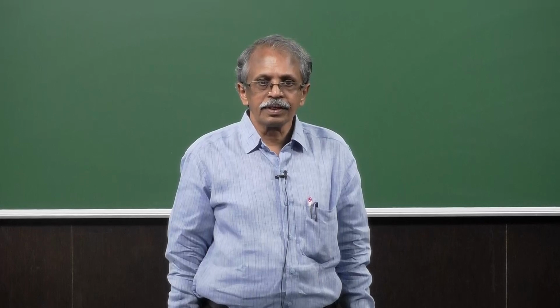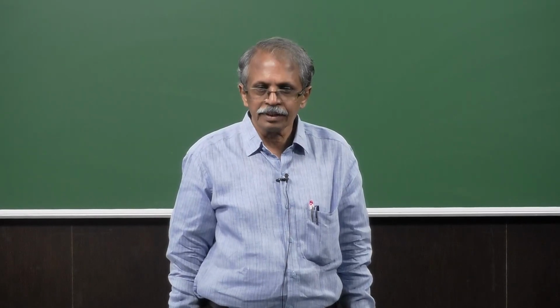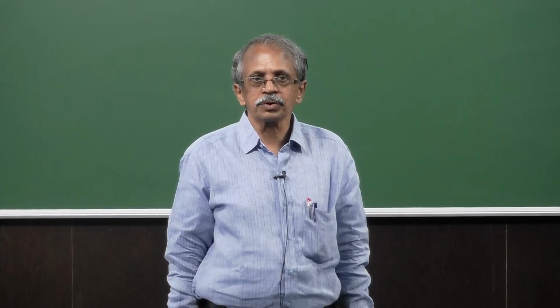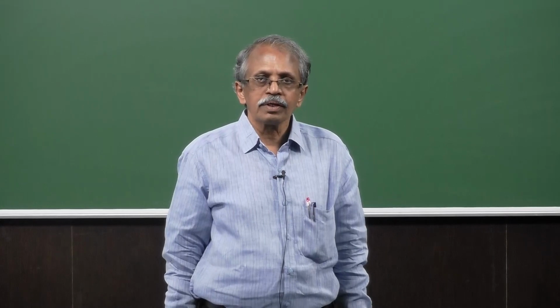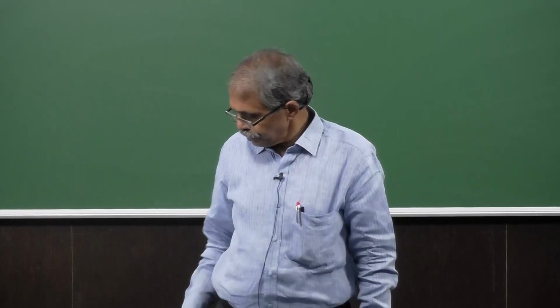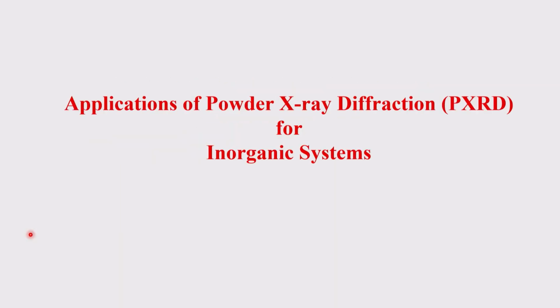So, this is a unique technique that comes under the diffraction method, and it is highly useful for all the compounds, organic and inorganic as well. Of course, in the case of inorganic compounds and nanomaterials, there is a huge amount of application. So, this topic is going to be on the applications of powder XRD towards inorganic systems.